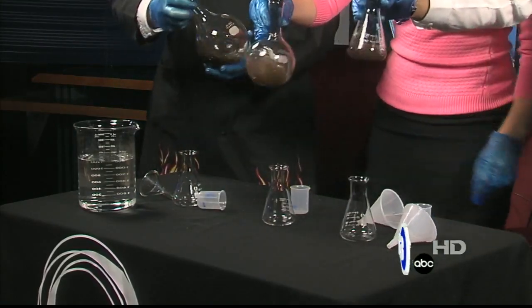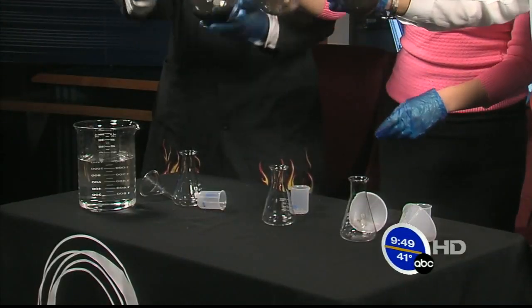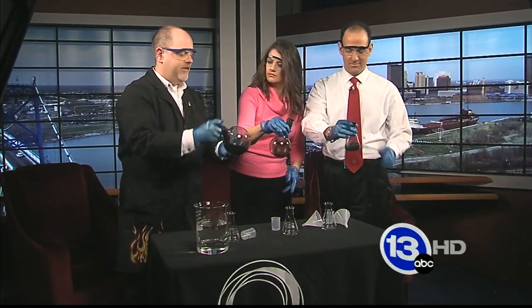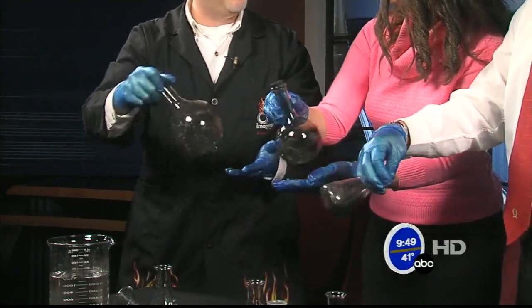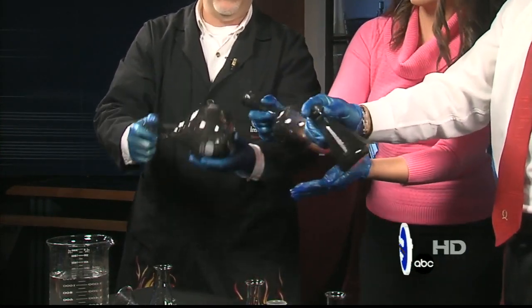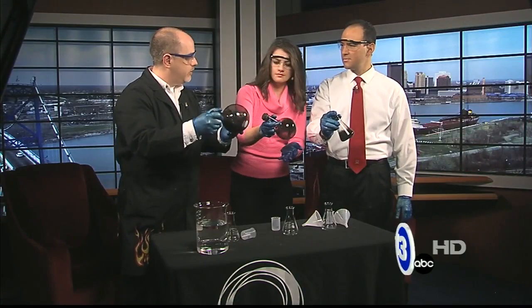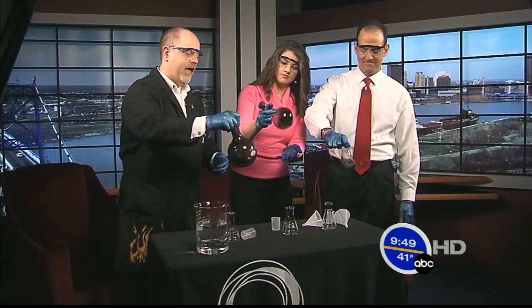Now we get this horribly nasty-looking sort of component. You don't want to turn it sideways — turn it sideways. What we're trying to do is coat the entire inside of the beaker with this compound. Now one of the things that people take for granted these days are mirrors. Inside these flasks, we actually have two reactions happening with a silver compound, and very slowly some silver metal is coming out of the solution and beginning to coat the inside of the flask.